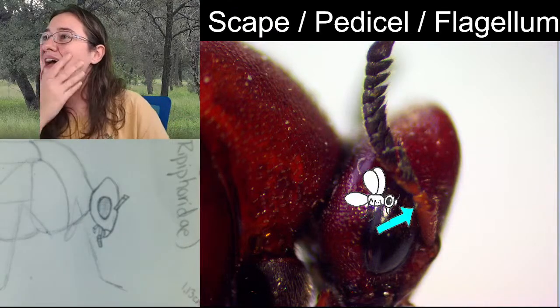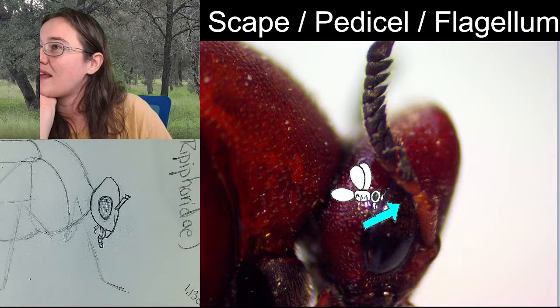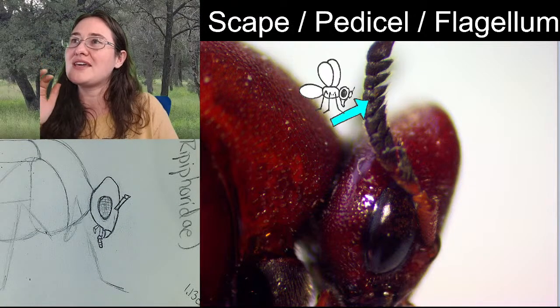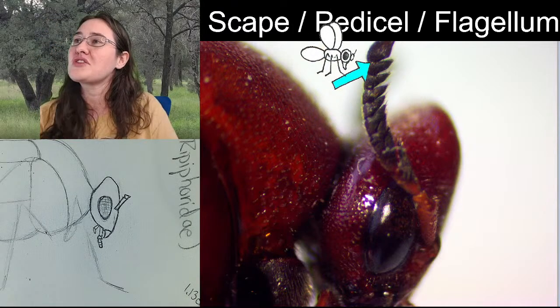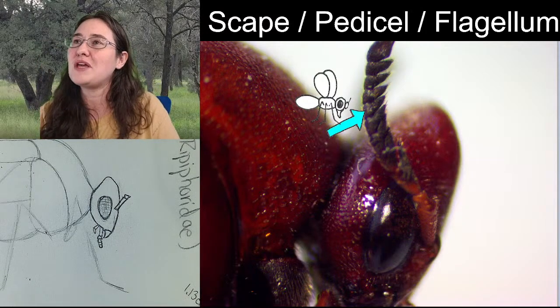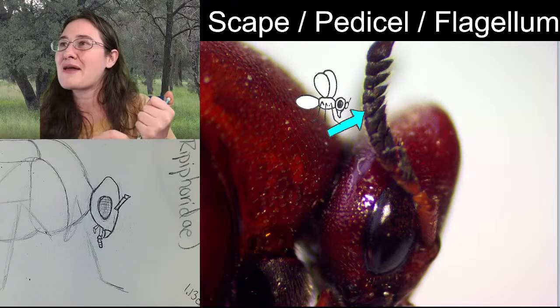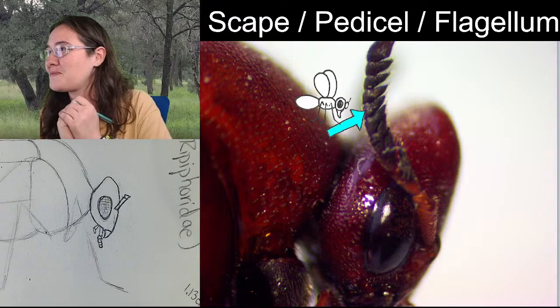All right, and then it almost looks like the third segment, or the first segment of the flagellum, is half orange and half dark, and then the rest of the antenna are pretty dark. Now, Eric had mentioned that the males have that large comb-like antenna, and I do remember seeing pictures of those with the really large combs. So it almost looks like this one could have a comb, but it's kind of like the shorter ones. So that could be the difference, the size of the combs, kind of like the size of the combs in moths. That's how I imagine it. Because these, it almost looks like if you lengthened those, it would look like the comb.